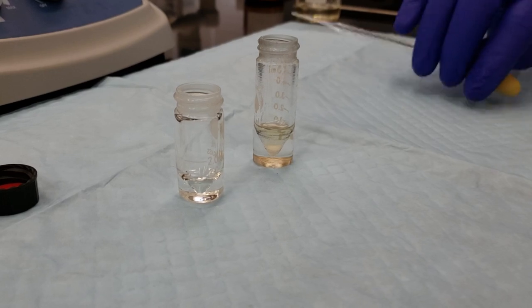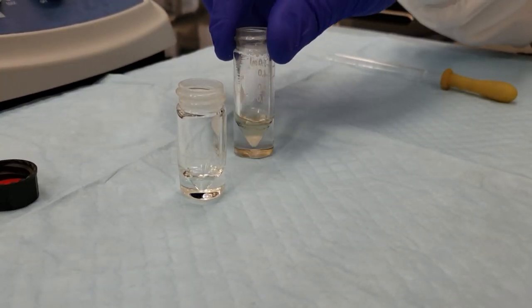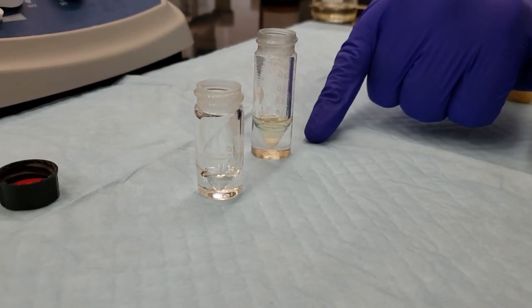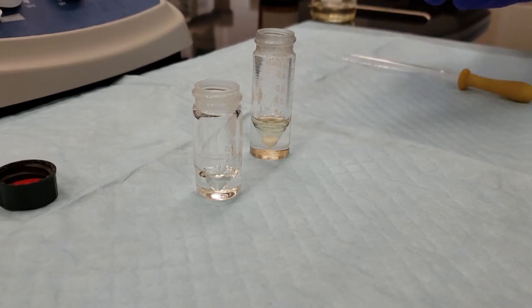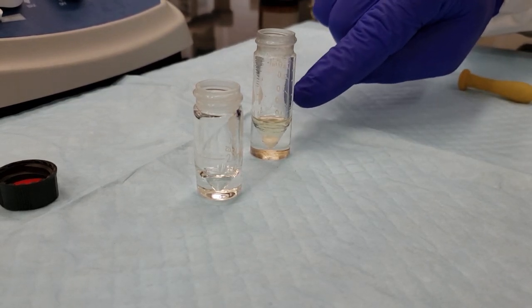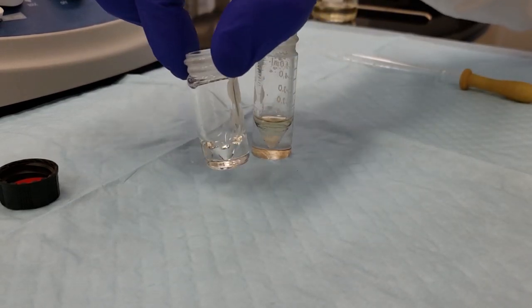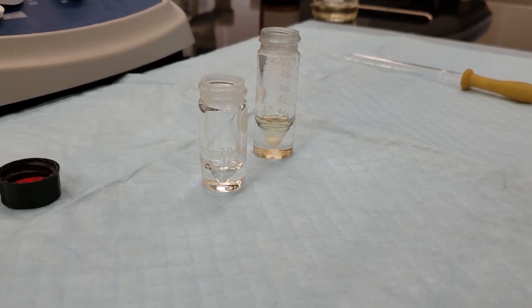So we're ready to isolate our final product. We can see our sodium bicarb layer in the bottom. That's neutralizing our sulfuric acid. We're going to draw off the alkyl halide layer. Now, just to be safe, I'm not going to take everything out of the vial that I placed into my pre-weighed clean 3 mL conical vial. So there is going to be a slight loss in our overall weight of product, but we expect that.